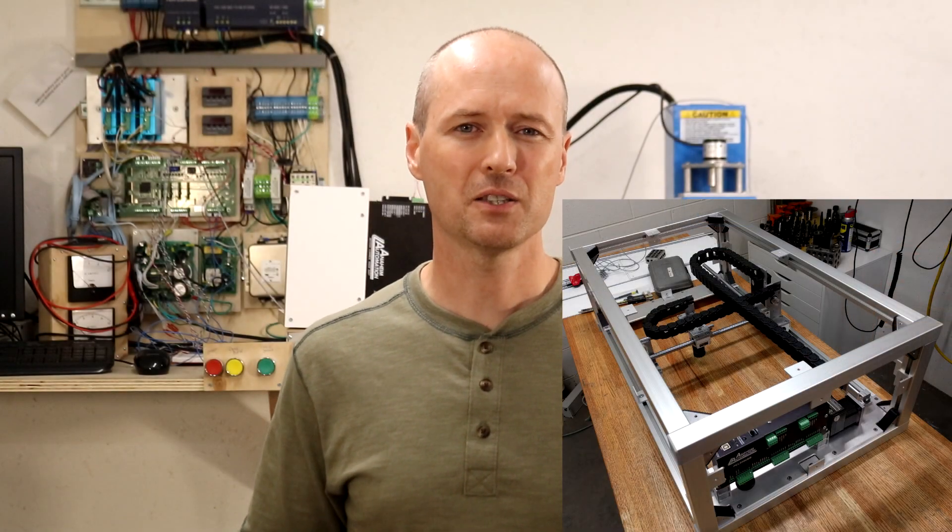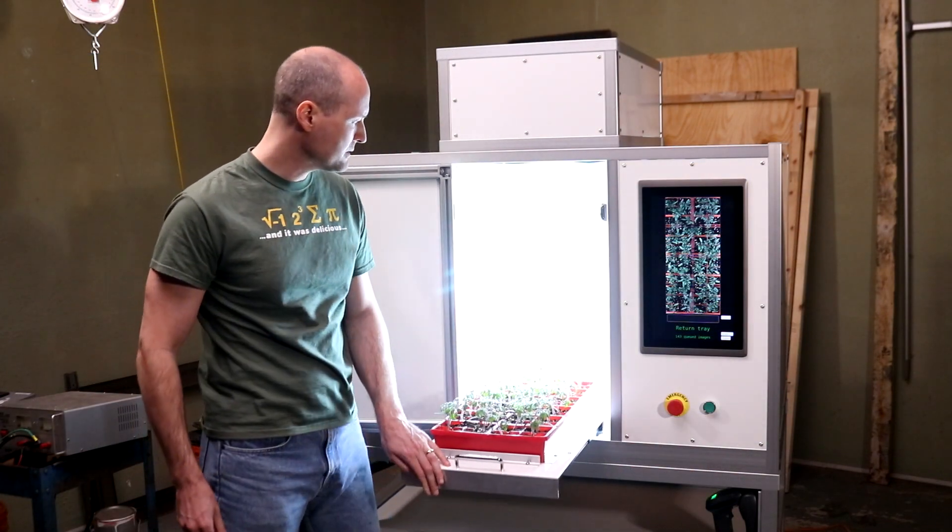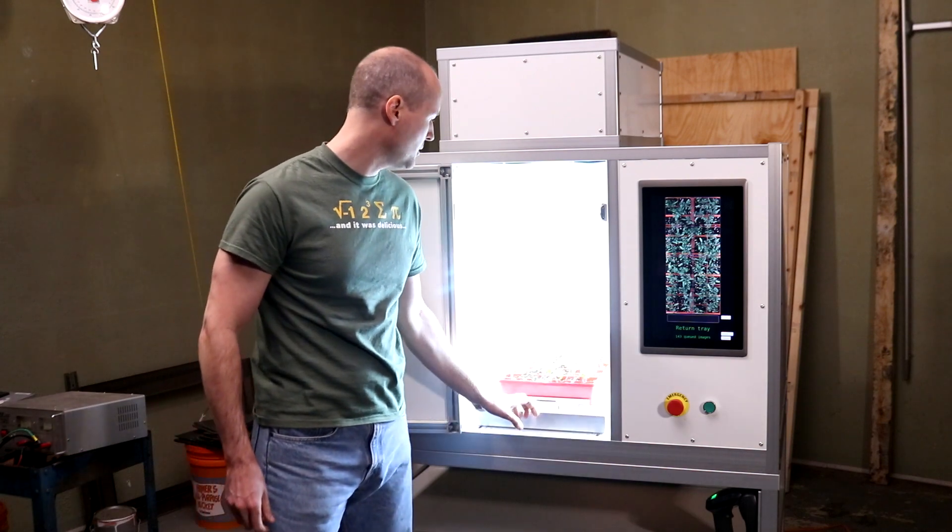Hi everyone, my name is Kent and in this video I'll describe the machining of the parts of a 2D or XY camera stage. I use this camera stage in my plant imaging and phenotyping systems and its purpose is to move a camera above a tray, scanning all the plants in the tray.